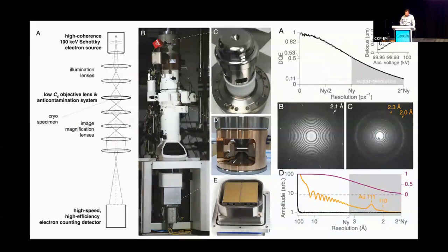And this was important because this is the actual magnification we used for all of the structure determinations, or just about all, save the ribosome. And so we wanted to be sure that we actually could get effective resolution well out into the super resolution range, and we could. So essentially, these measurements convinced us that the optical system here was all done correctly and was performing as we wanted. This was the case in about December a year ago. Well, a year and 4 months ago now. And so in January, we decided to start testing this thing for real.